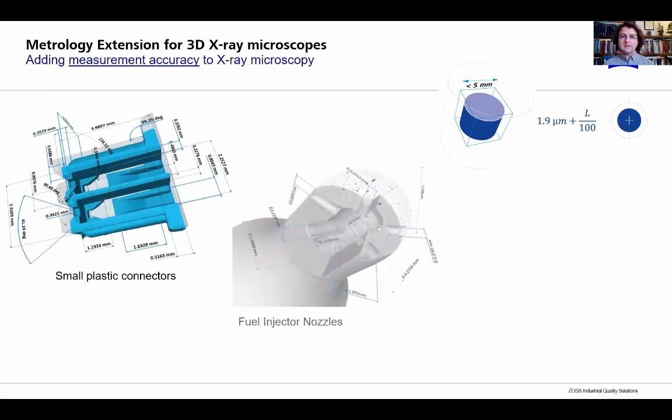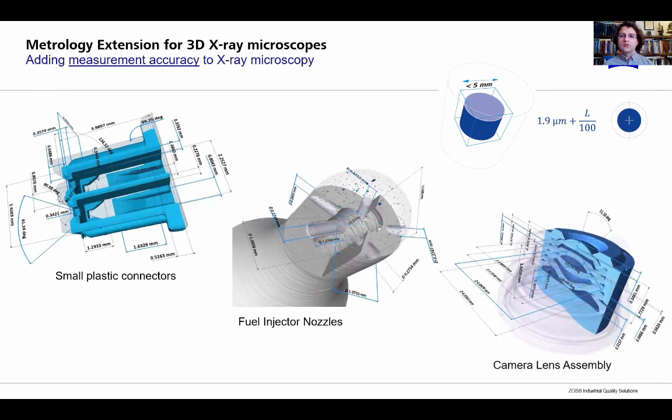There are several examples in which our metrology workflow for 3D X-ray microscopes can be used. For further details, please check out our open poster at the I2MTC website.